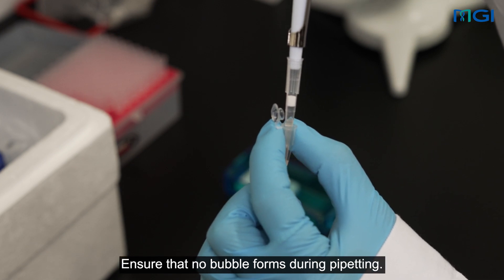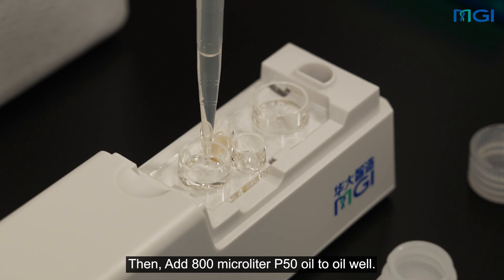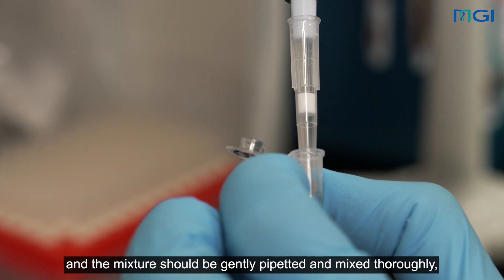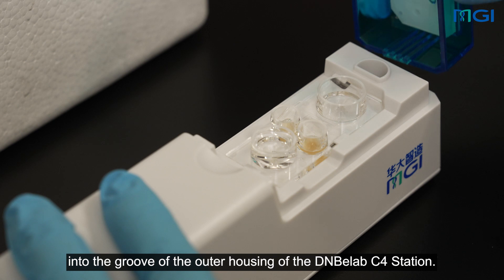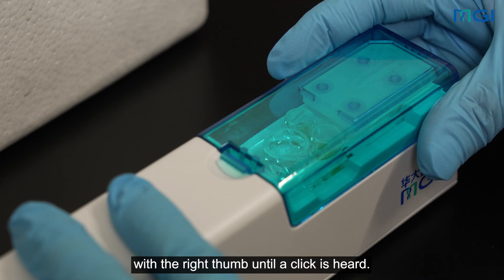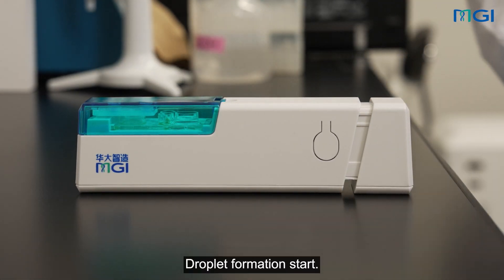Ensure that no bubble forms during pipetting. Add 80 µL cell suspension to the cell well. Then, add 800 µL P50 oil to the oil well. Add 8 µL of the de-reagent V2 to the bead suspension. The de-reagent V2 should be added to the bead suspension before droplet formation, and the mixture should be gently pipetted and mixed thoroughly, to avoid formation of bubbles. Add 80 µL bead suspension to the beads well. Insert the tail end of the protective cover into the groove of the outer housing of the DNBLAB C4 station. Press and hold the other end of the C4 station with the left thumb. Press the front end of the protective cover into the groove with the right thumb until a click is heard. Hold the front of the C4 station and pull out the tail until a click is heard. Droplet formation start.